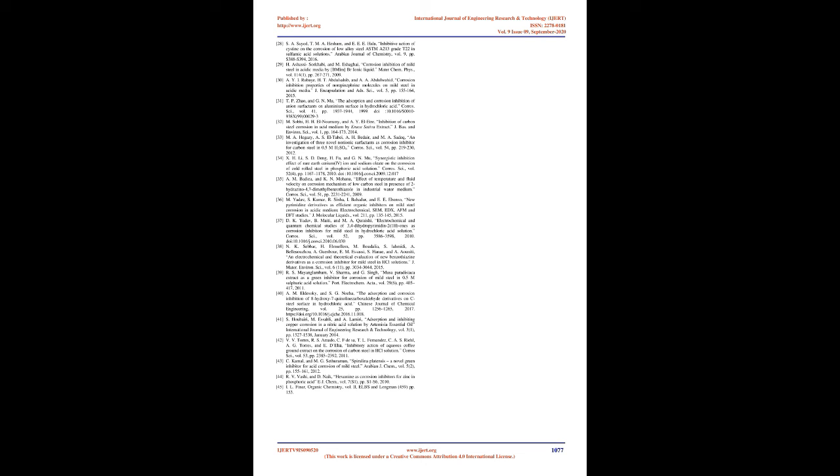SEM images were used to investigate the surface morphology of MS before and after 24 hours of immersion in the 0.5 M acetic acid solution without and with inhibitor. Fig 6a indicates that the surface of the MS is smooth. Fig 6b shows the image of the MS sample immersed in 0.5 M acetic acid for 24 hours. It is noted that the surface of the MS was severely corroded because of the aggressive attack of 0.5 M acetic acid. Fig 6c shows the SEM image of the MS immersed in the acid solution in the presence of 15 mM hexamine for 24 hours.